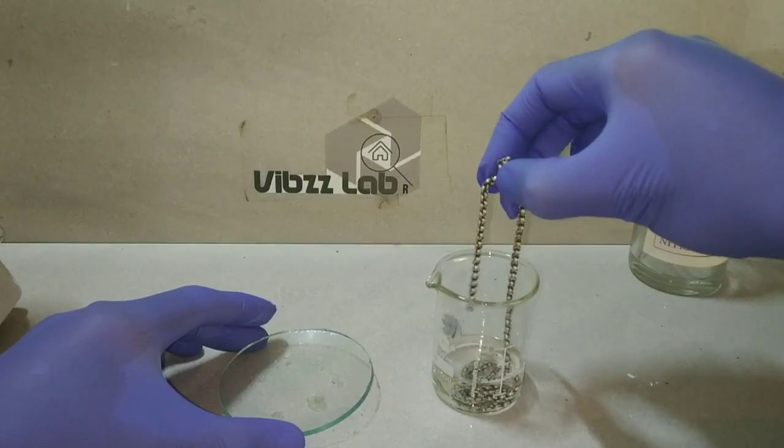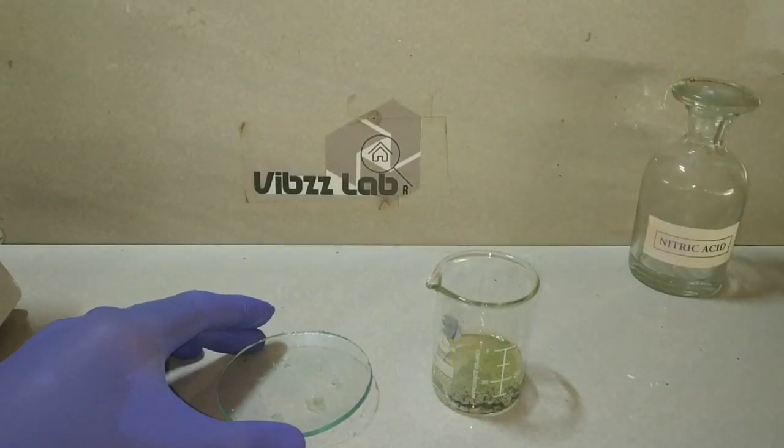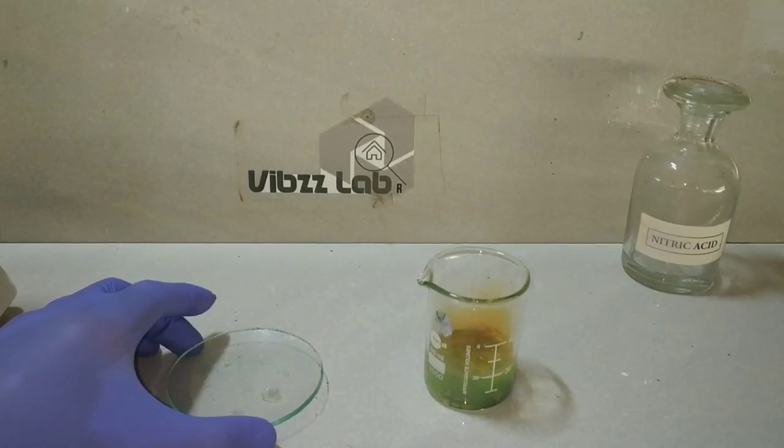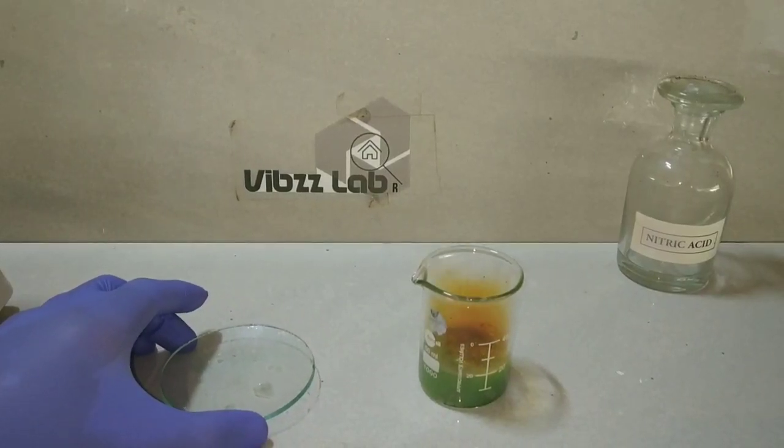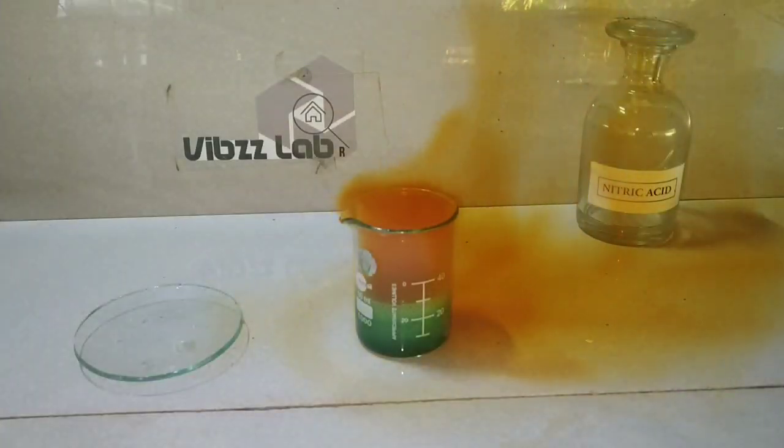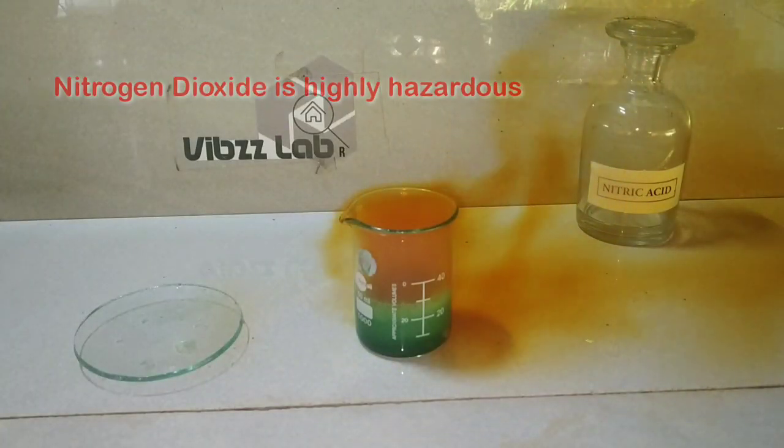So the first step in extraction of silver metal is to dip this in concentrated nitric acid. I have 10.8 grams of silver ornament by weight and I have taken about 40 ml of concentrated nitric acid.